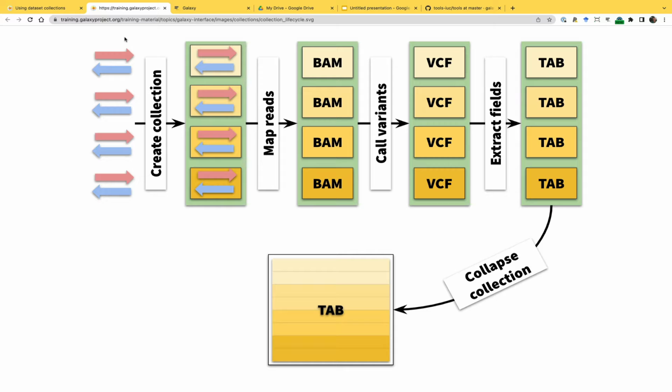But paired data is a good example because it illustrates layered data. You have one sample, but it usually has 2 files associated with it, forward reads and reverse. And it's a minimal example because we only have 4 samples. But the point I'm trying to make here is that very few analyses in biology are done on one sample. It rarely makes sense for 2 reasons.